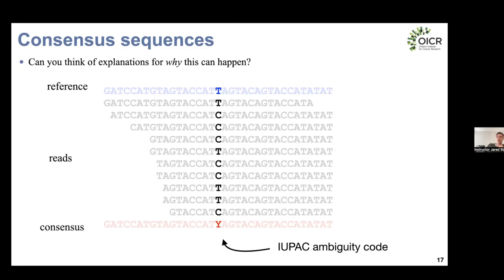Now, the main danger there is that if there was, say, some splash over between wells on your plate, you can get cross-contamination between samples. So we developed a lot of tools for detecting contamination that give you this pattern of variance where you can have multiple mixed bases.